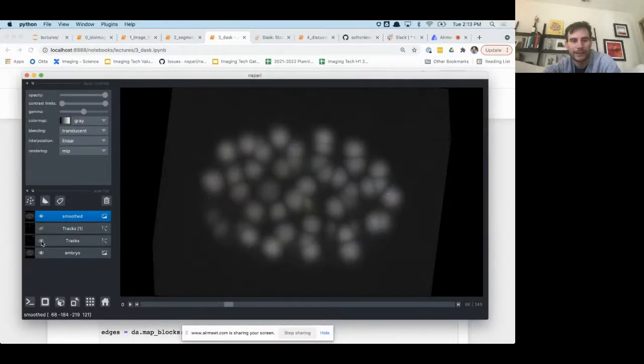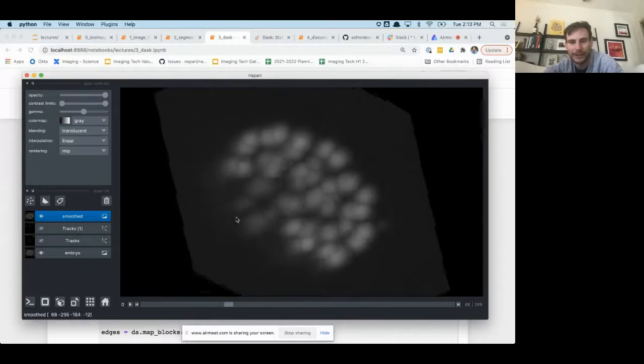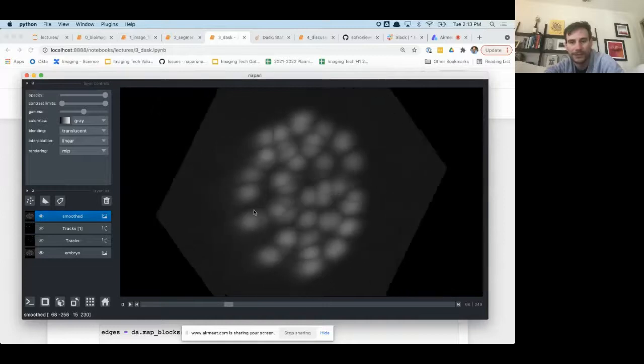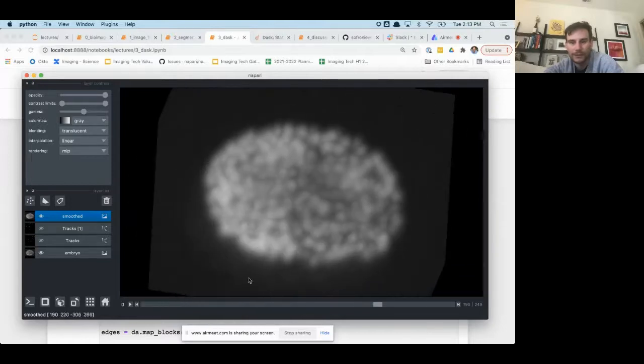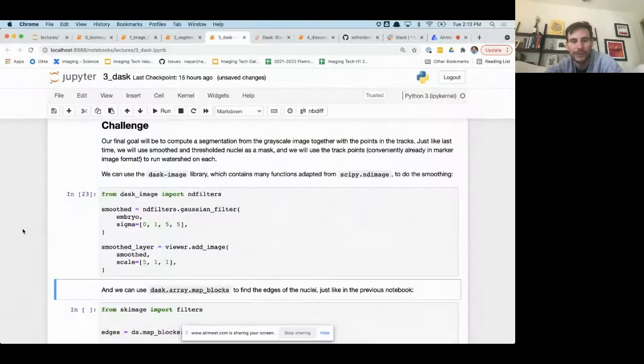And we can see how this is now much nicer than before. So it's going to be much easier to do a segmentation on this. And let me come out here. It's quite simple. Come back here. So, it's blurred for sure a little bit from the Gaussian. Maybe we should do median filtering instead.